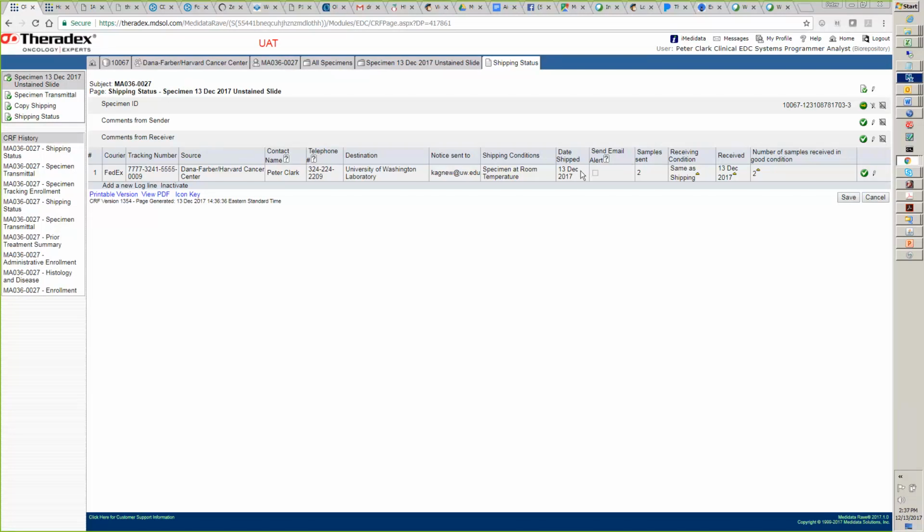The difference is that the user at the site saved this record, and when they saved it, Rave considered it to be complete, even though these values weren't filled out. Okay. So there weren't any special edit checks that would mark these as required. So we didn't want queries to pop up that would disturb the treating site to think that they hadn't completed everything that they were supposed to.